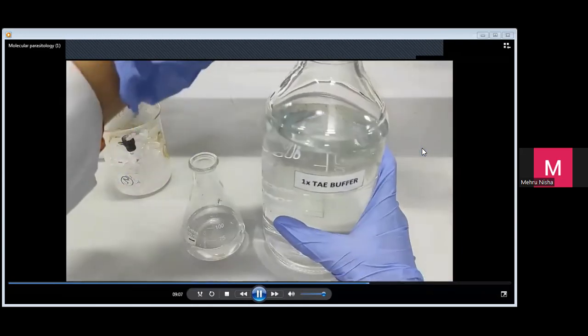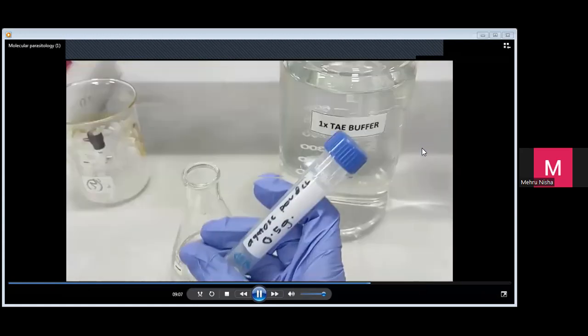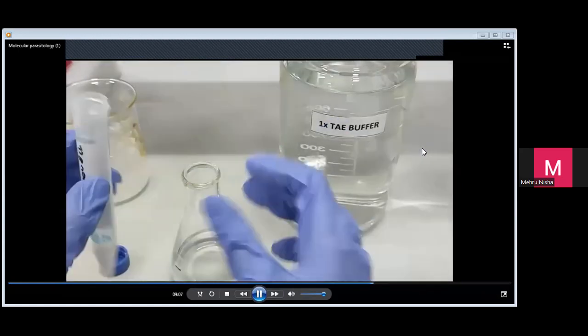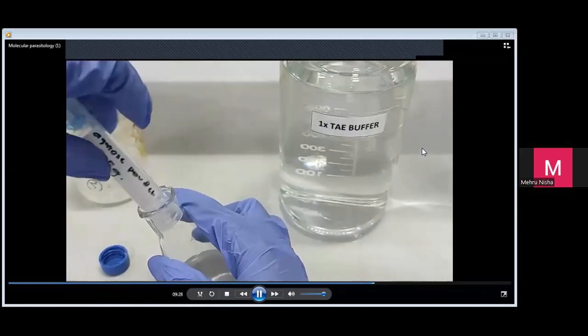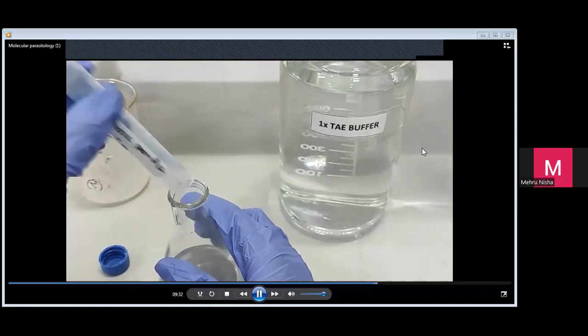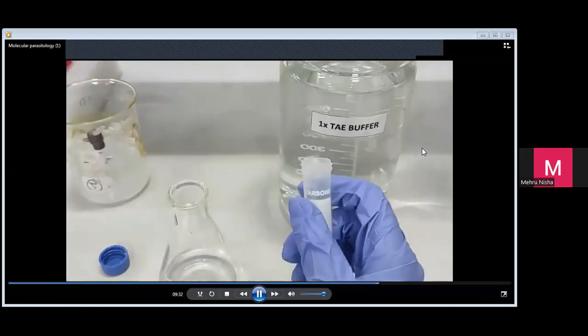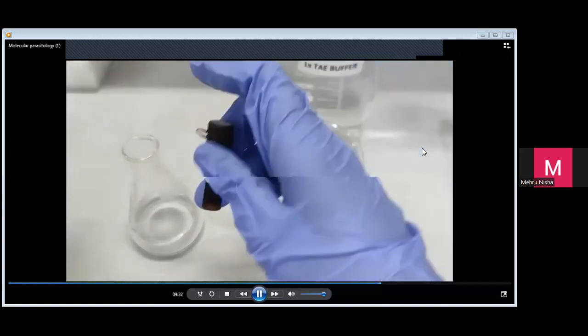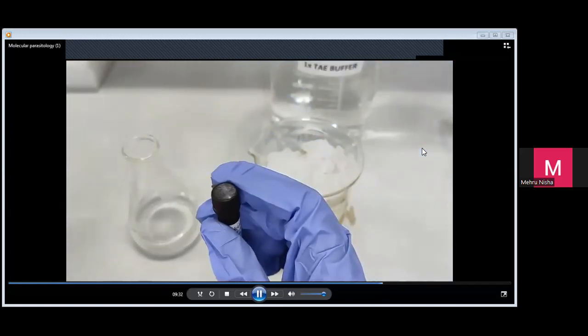We call it one time TAE buffer. From 10 time we make it 1 time. Then you masukkan serbuk agarose. Untuk 1% gel, we kena perlukan 1 gram agarose di 100 ml of TAE buffer.